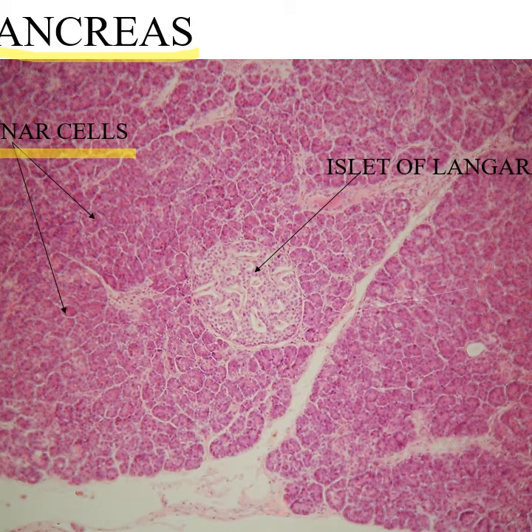The other part, you'll notice this. I'll kind of go around it a bit. This thing right here, and there's probably another little smaller irregular one here. These are the islets of Langerhans. So there's a nice big round one here. That looks really nice. That's easy to identify. A lot of the ones on your slides kind of look more like this. They're still doable. Note they stain lighter. And really all you have to know about this at this point is these contain the endocrine cells.